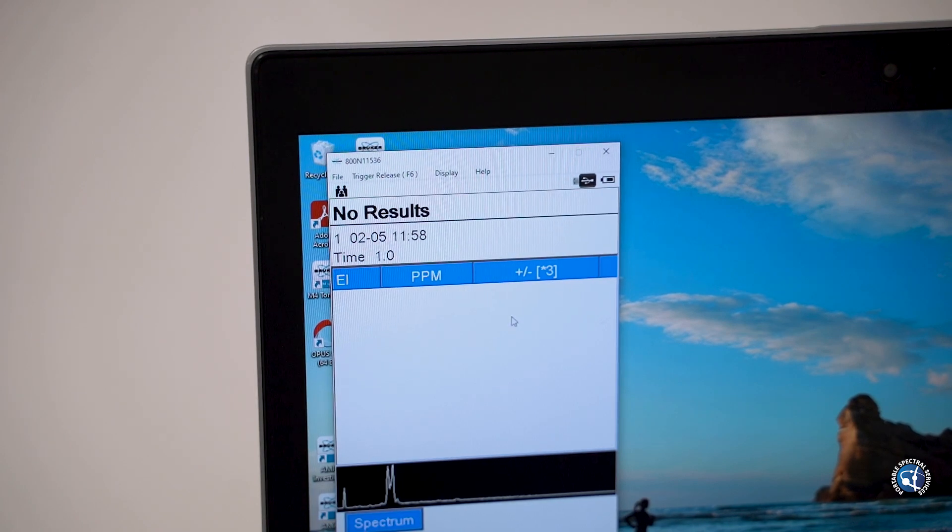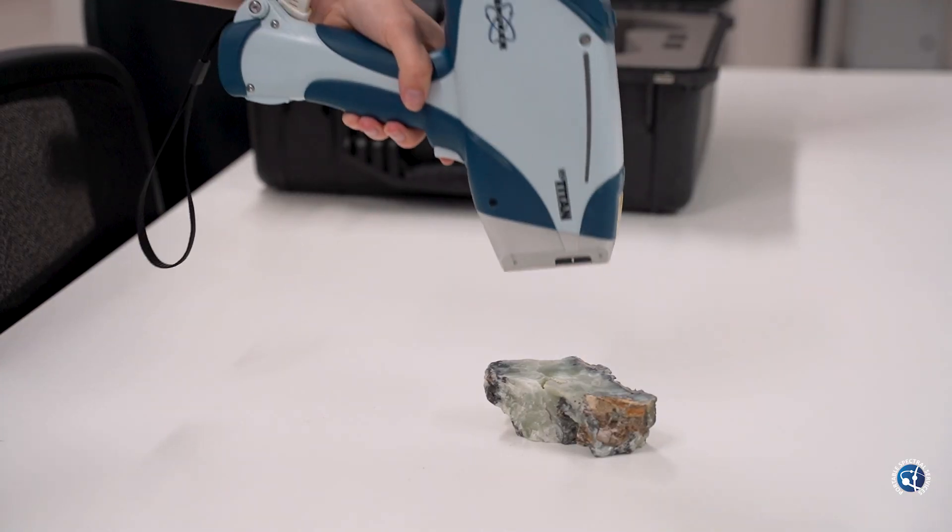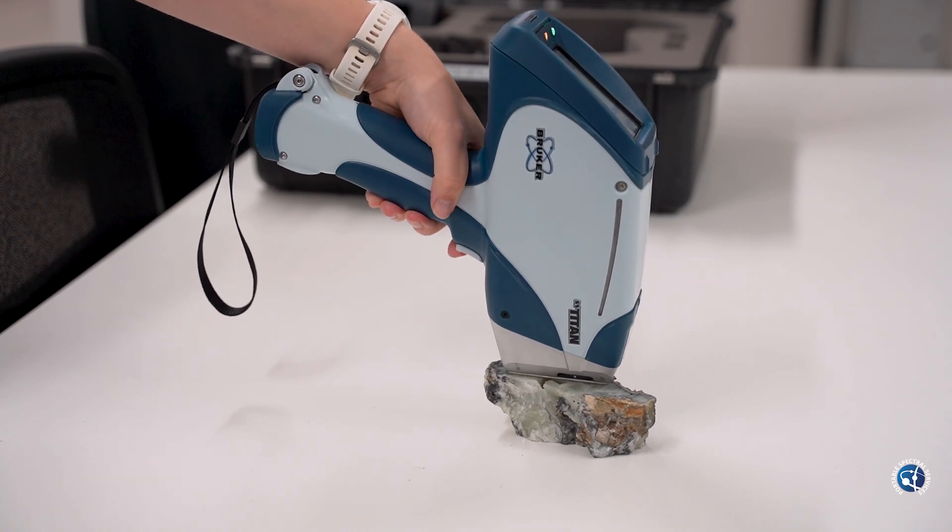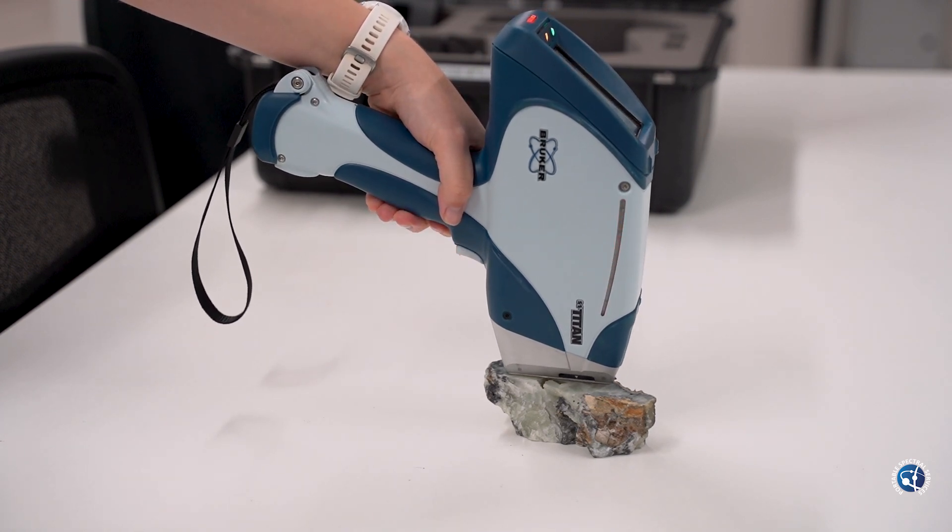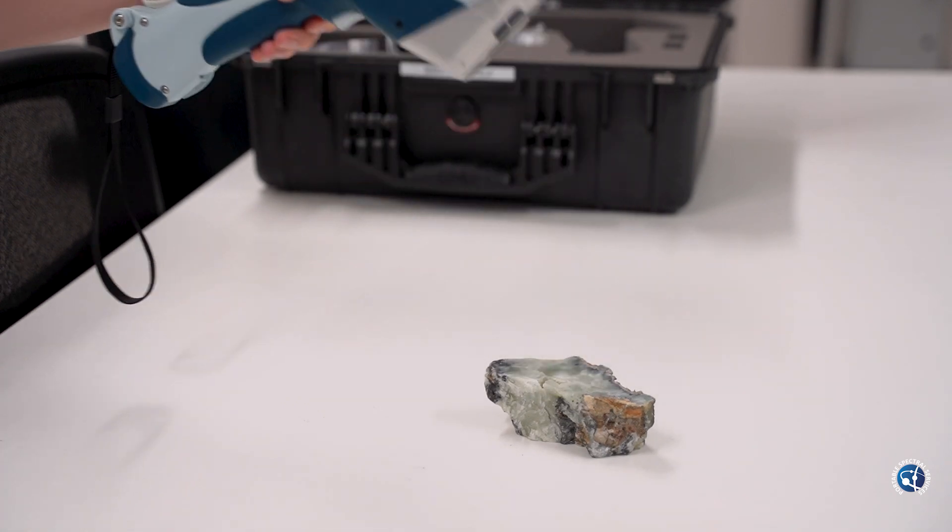Most calibrations require 60 seconds minimum total scan time. Dependent on the calibration, this is divided over each beam phrase. It is recommended to analyze for the full recommended time and if you are unsure of this, please contact Portable Spectral Services for clarification.